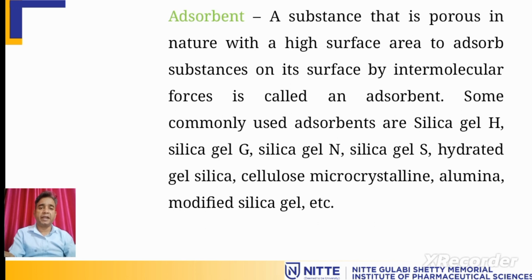When equilibrium is attained, depending on the nature of the compound, it spends more time on the stationary phase and less time in the mobile phase, or vice versa, it spends more time in the mobile phase and less time on the stationary phase, which makes it elute, right?